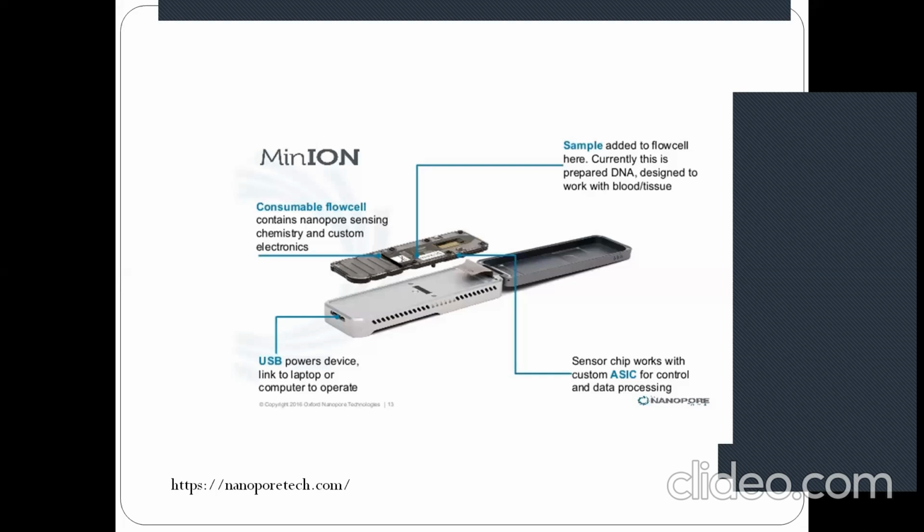One sequencing goes from this side to this side, and another sequencing you can achieve from the opposite side. Whatever G, C, or A is captured, base calling gives you an accurate idea of the percentage of that G, C, T, or A. There is one statistic: if any base call is less than 70%, the system does not consider that base an appropriate nucleotide.